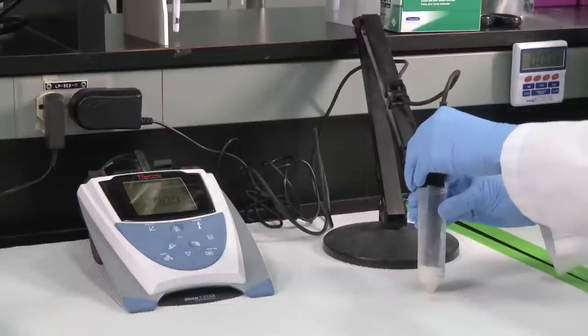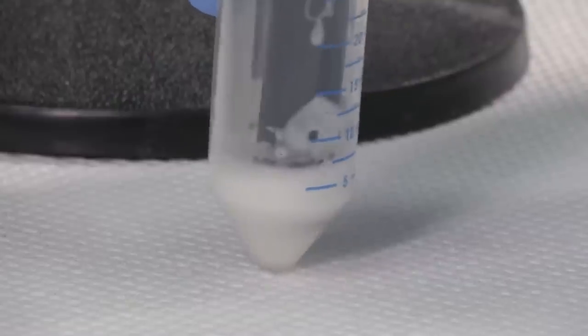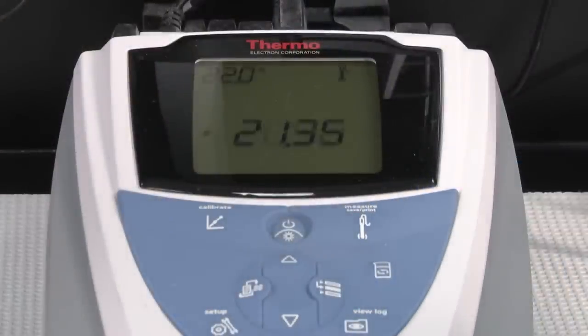Measure the conductivity of the emulsion, making sure that the conductivity probe is fully immersed in the emulsion. Record the conductivity for the amount of oil used. You may notice the reading may fluctuate a little. That's normal.